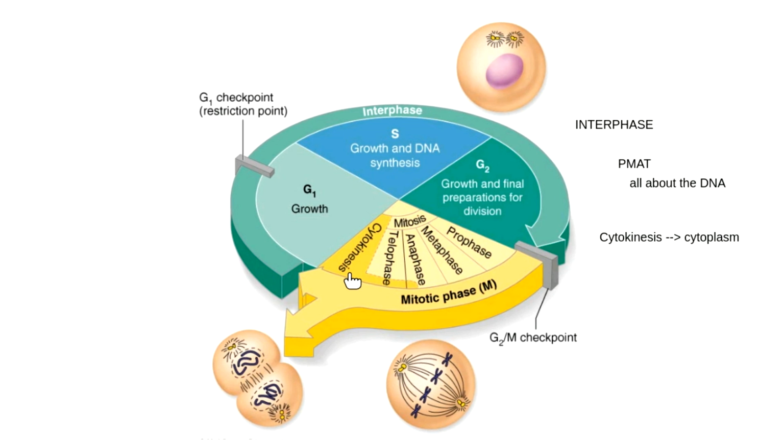Notice that the process of cytokinesis is not part of mitosis. It happens mostly after mitosis is done, but you can see this little creeping line right here. Cytokinesis actually happens a lot during the mitosis phase of telophase, and that's going to be the way that we most easily identify telophase, as we start to see the process of cytokinesis happening as well.